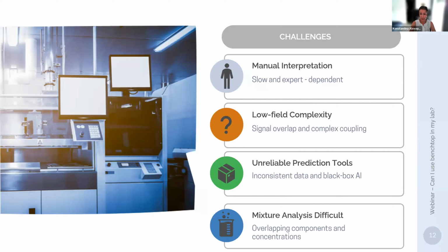So we identify four main challenges in today's NMR workflows. First of all, manual interpretation is often slow and heavily dependent on the expert knowledge. Second, low-field instruments can struggle with signal overlap and complex coupling patterns. Third, the prediction tools that have been used do not always provide the reliability and the transparency that the users need.